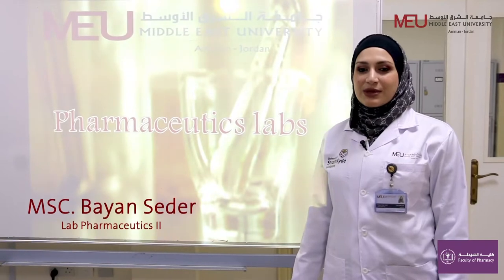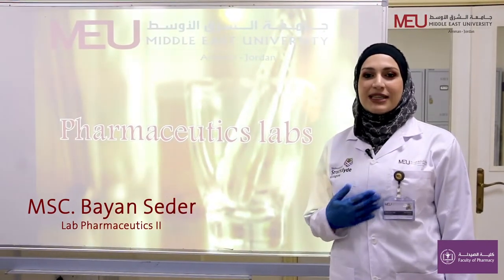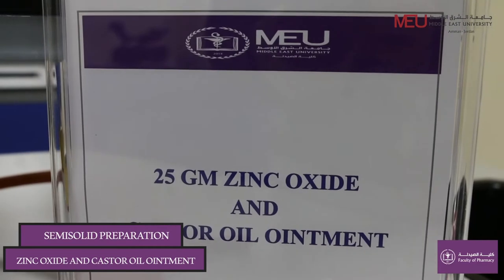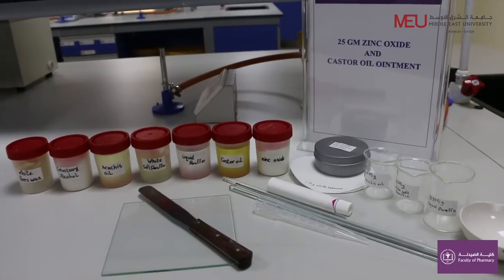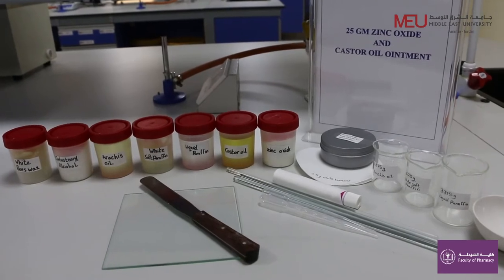Hello everyone, welcome to Pharmaceutics Lab. I am pharmacist Bayan Sader from the Faculty of Pharmacy at Middle East University. In this video I'm going to discuss how to prepare 25 grams of zinc oxide and castor oil ointment, which we use to relieve diaper rash and for softening and protection of the skin. Let's start the procedure.